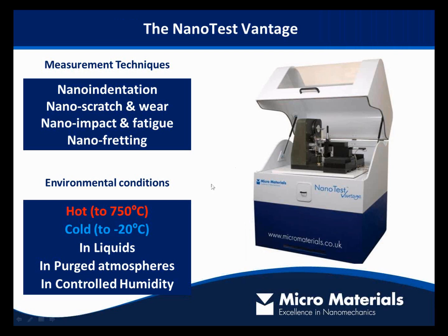But I think the key thing is, alongside that, is that we can perform these tests over a wide range of different environmental conditions. We can do the tests at high temperature up to 750 degrees Celsius. We can reduce the test temperature below ambient down to about -20 degrees.